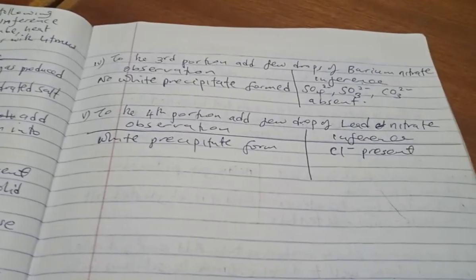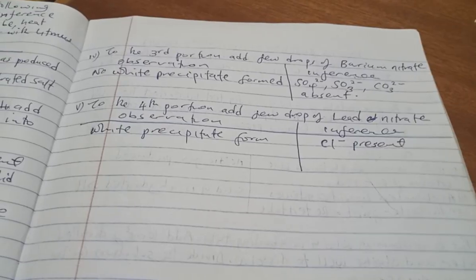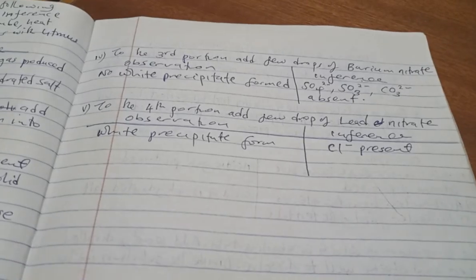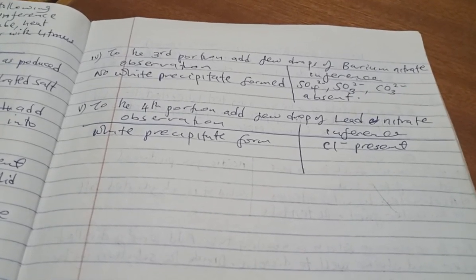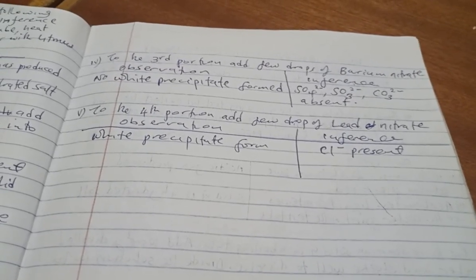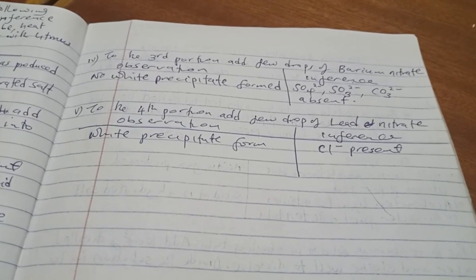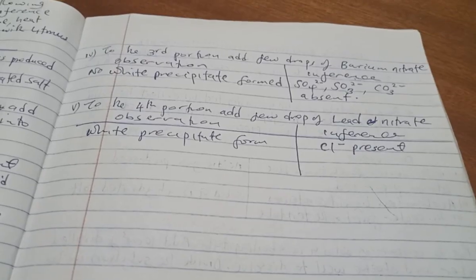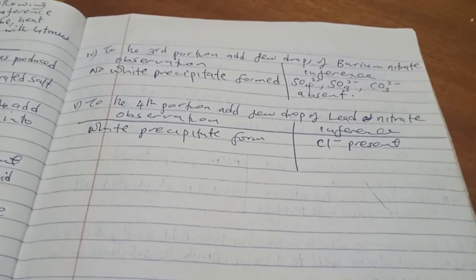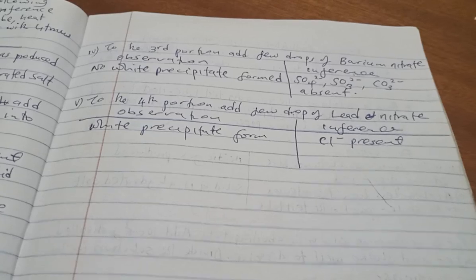So if you are given barium nitrate and you see no white precipitate, then you can easily and comfortably say that sulfate ion and carbonate ion are absent, because they are the only ions that will form white precipitate with barium. If you see a white precipitate, then they are present. If they are absent, then we may have either iodide or chloride, the group 7.